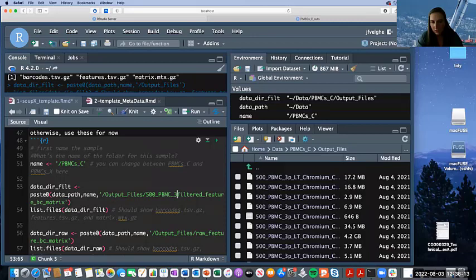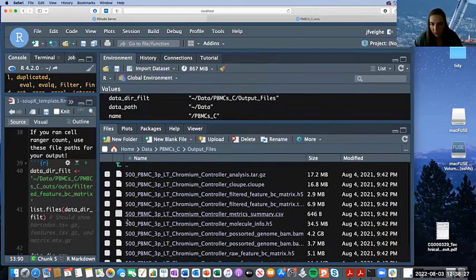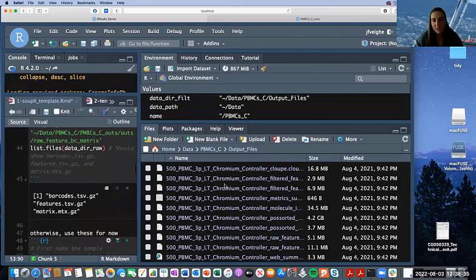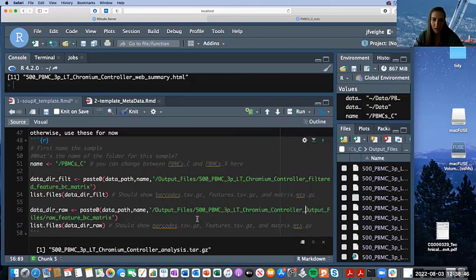So 3P. And let's make sure that matches. The ones you're going to put in this name, you're basically putting in this name and you want to refer to the folder containing your FASTQ files. So if that one has a name, update the name. I tried adjusting it and I'm trying to autocomplete so I don't have to type it out, and when I start typing 500, it's not coming up.